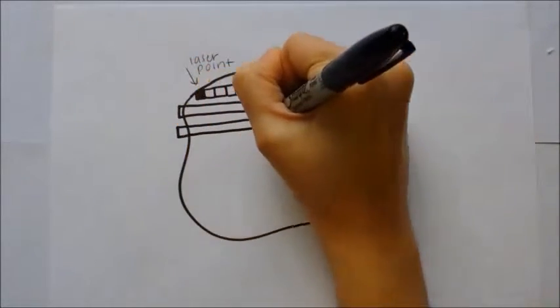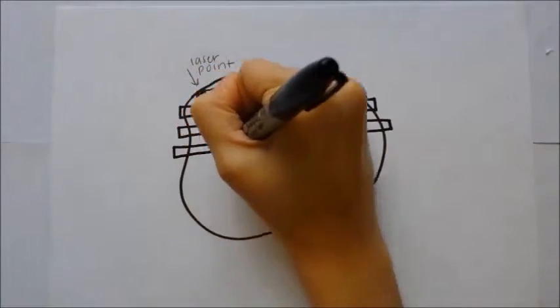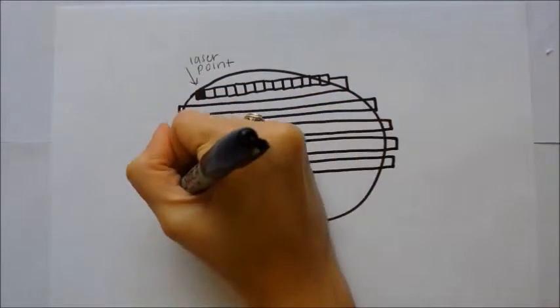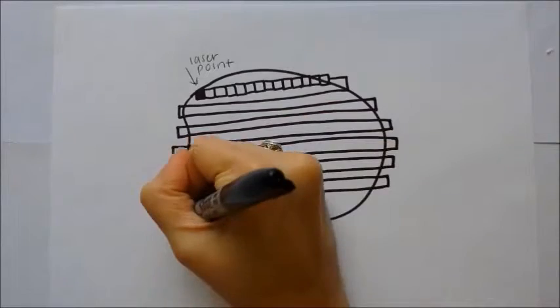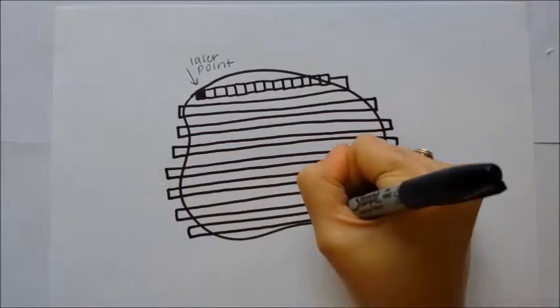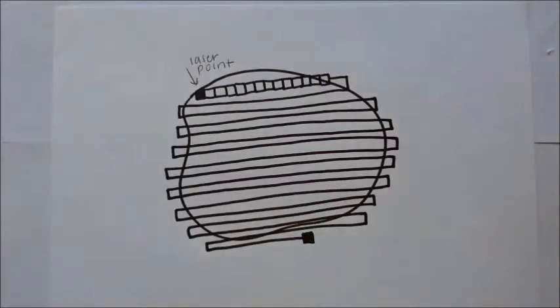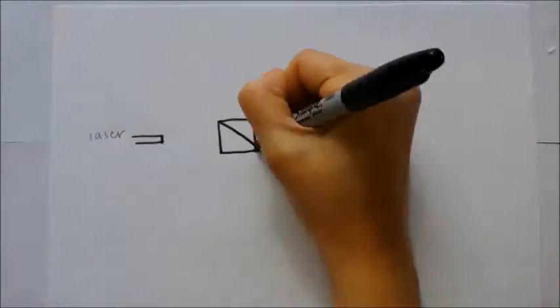Since the laser is scanned, the collection of light has to be different and cannot use a camera. The laser moves pixel by pixel and light is collected at each pixel using a photomultiplier tube which collects photons and amplifies the signal, which creates a digital signal that can be processed by a computer to generate the whole image.